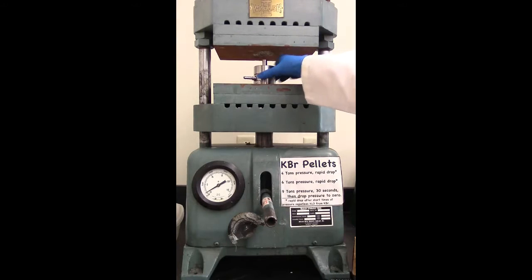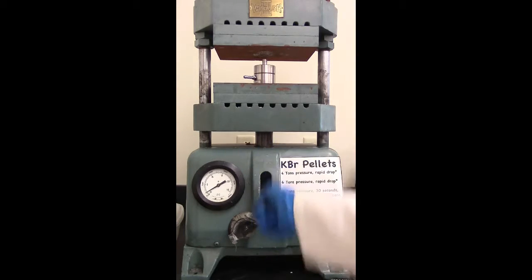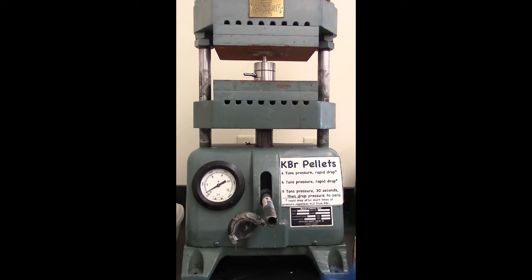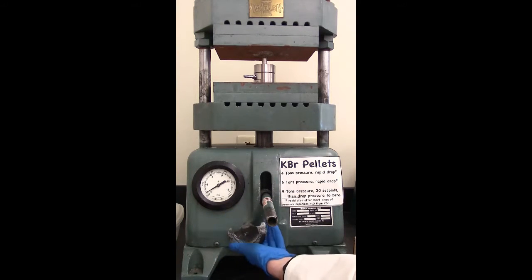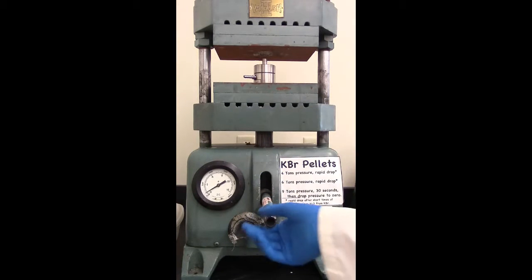So before we start pumping this up, we're going to place our press pellet in there. We do this in order to not only crush the crystals together to form one solid pellet, but we do a couple different steps in order to remove any H2O in the sample. So get it up to four tons of pressure, rapid drop. Then to six tons pressure and another rapid drop. And nine tons pressure, hold it for 30 seconds and then drop the pressure to zero.